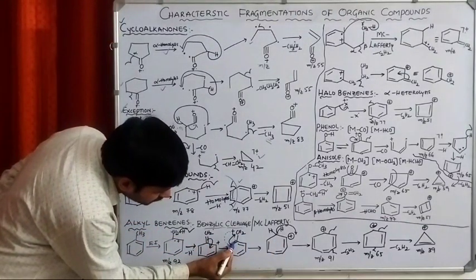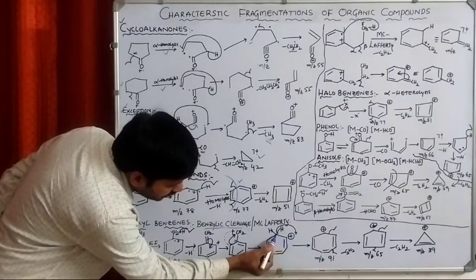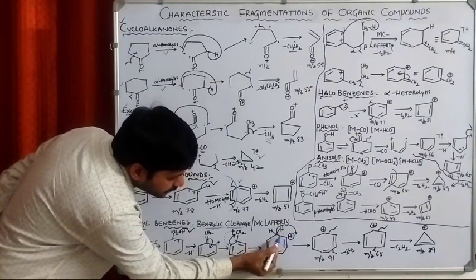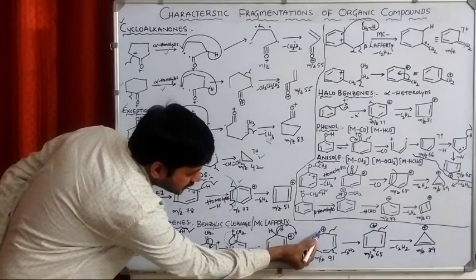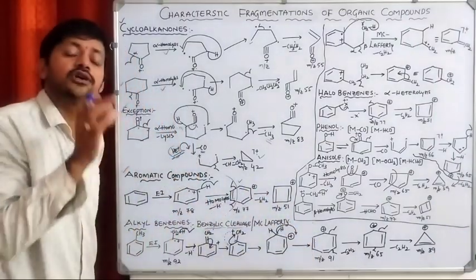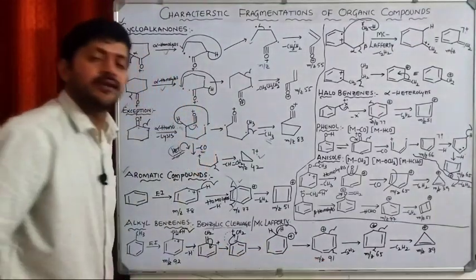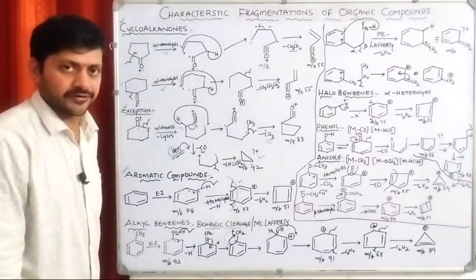This carbon is getting a positive charge or not? Positive charge. Here we have CH2, and one of the hydrogens is transferred towards the H plus. That's why we are creating a positive charge here. This is commonly called the tropylium cation. This m/z appears in the mass spectrum.